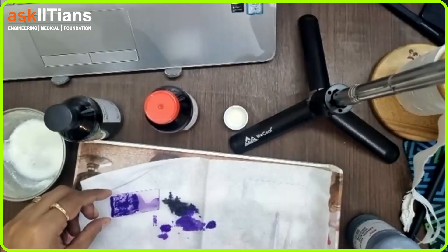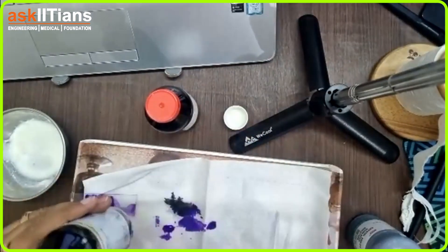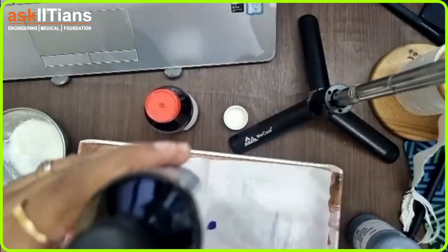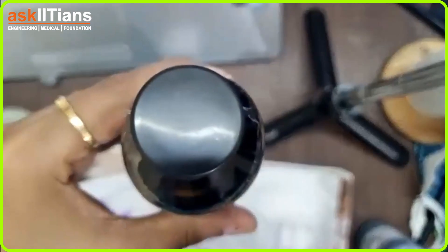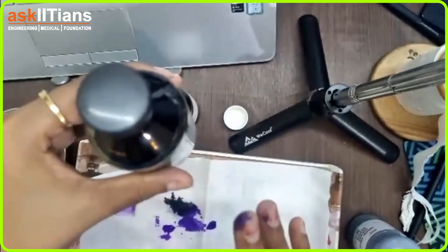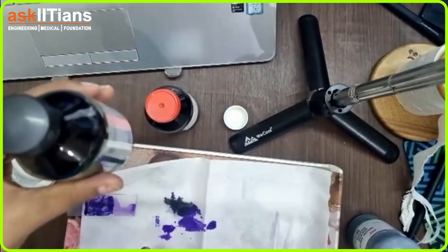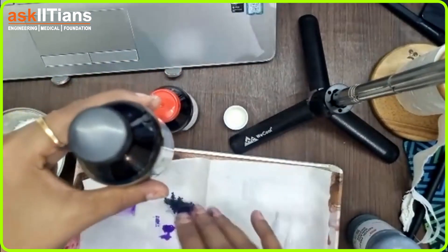Now the next step after washing: we have iodine, which is known as a fixing agent. Because the dye has entered inside the cell, iodine is going to help permanent bonds to be created — the crystal violet dye will make permanent bonds inside the cell.